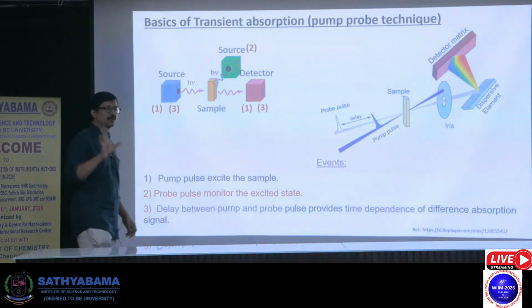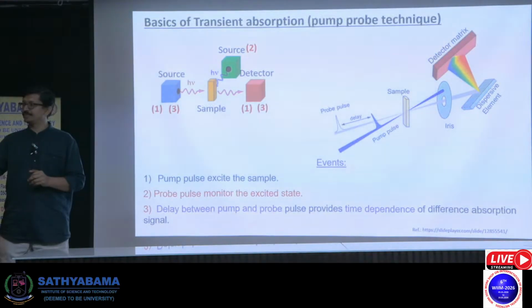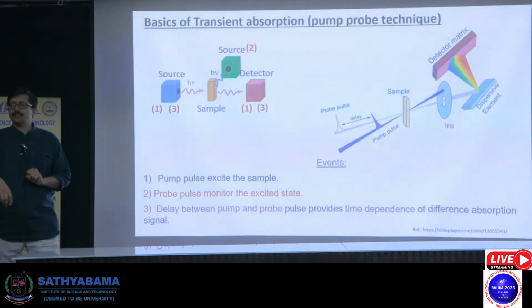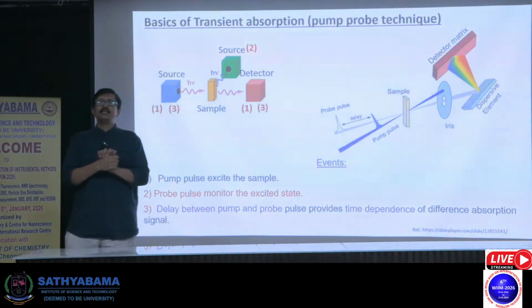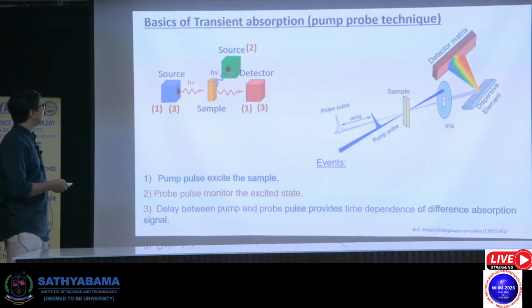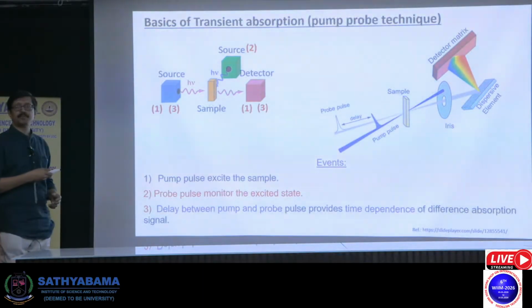I just want to talk about this topic, which is a kind of research topic. It's called transient absorption. So we talked about absorption spectroscopy, we talked about emission spectroscopy. This is called transient absorption. Transient absorption is also known as the pump-probe technique.